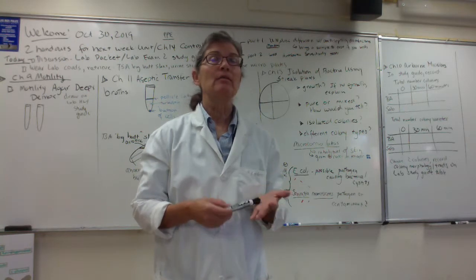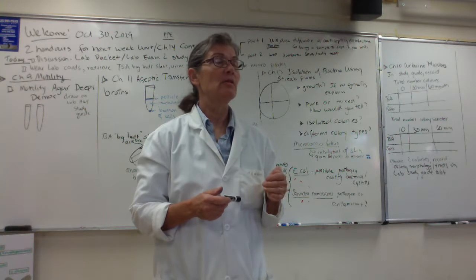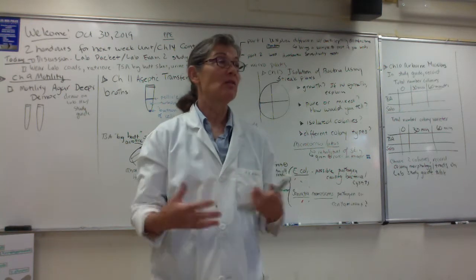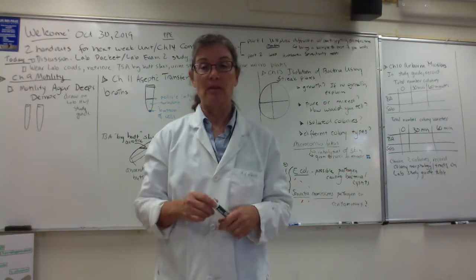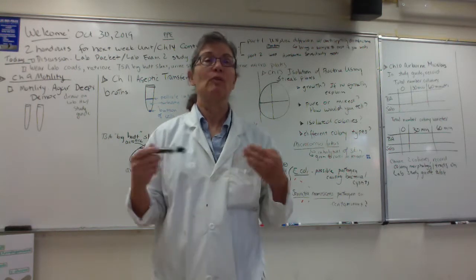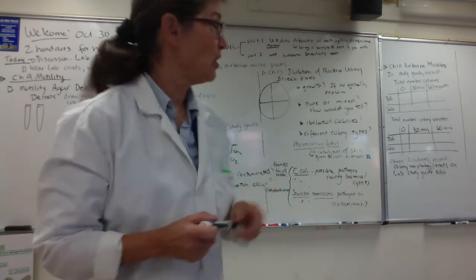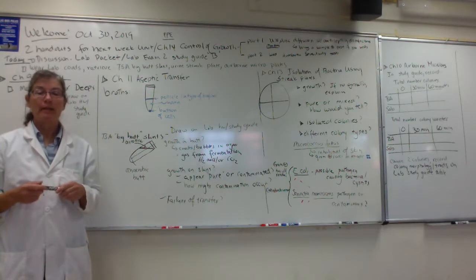And then another thing, folks, is the media that you've transferred the bacteria to. Maybe your bacterium can't grow on that medium, or maybe you grew them at a temperature at which they cannot grow, right? So these are all possibilities for failure of transfers. We try to make sure, you guys, for the microbes we give you, that they can grow on the medium, and that the temperature at which we ask you to incubate, your microbes will grow really well at that temperature.